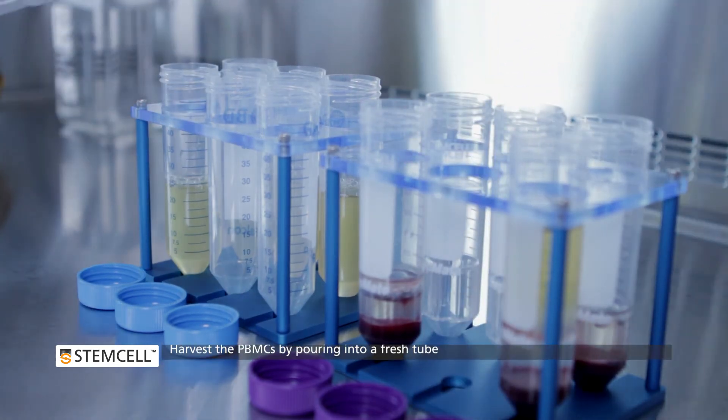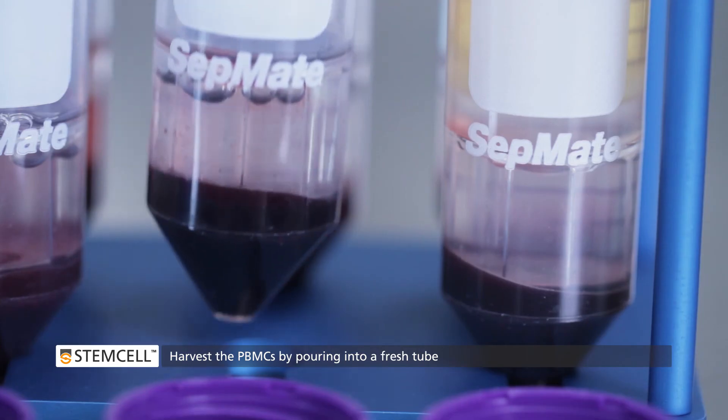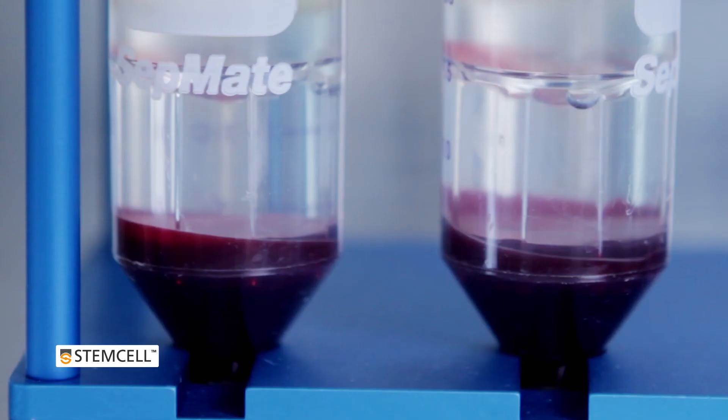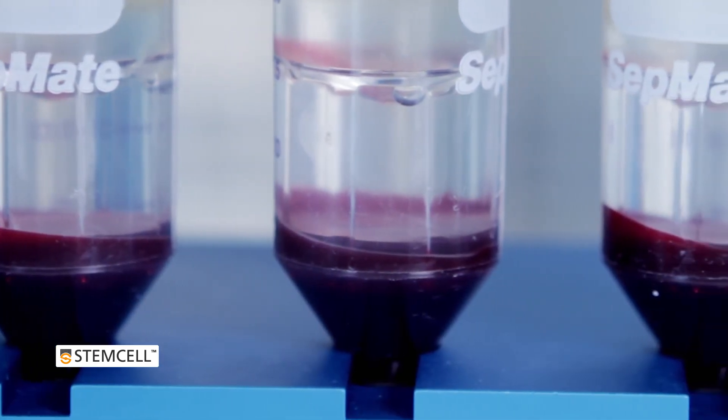Harvest the PBMCs by pouring the top layer into a new tube in one smooth motion. Do not leave the tube inverted for more than 2 seconds. The SEPMATE insert keeps red blood cells and Density Gradient Medium separate from the isolated PBMCs.